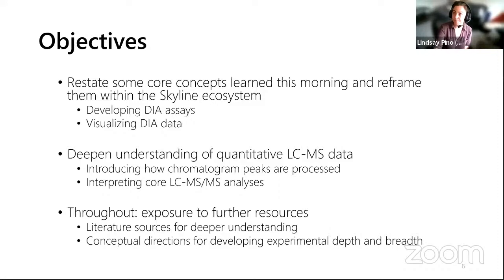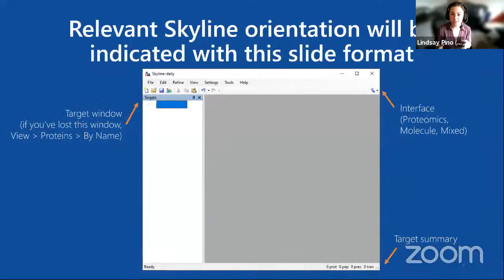So throughout the first part of the talk, anything that's relevant to Skyline as the software is going to have this blue background with the white text. Just to orient you really quick, and if you'd like, you can follow along with Skyline open on a second monitor or this playing in the background while you look at Skyline.